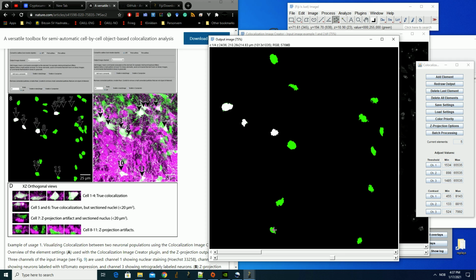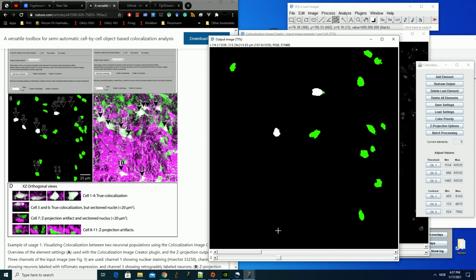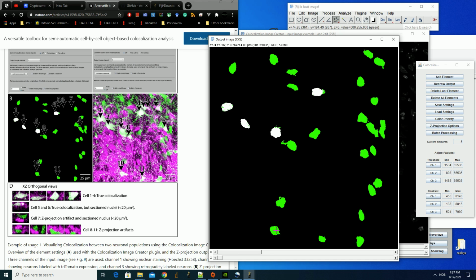I should have shown you also where you would have another signal here, for example blue or white or something, but then it would only show the topmost object, only the white or the blue or the green, never a mix of the colors, because binary elements never mix. So that was the first example, and you can see now how it's much easier to count these populations.